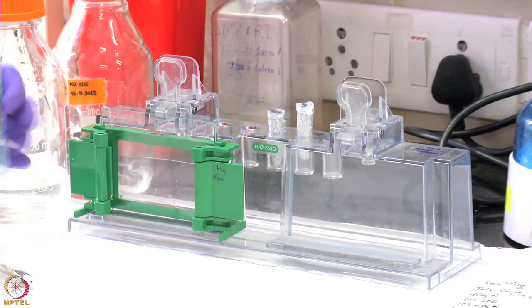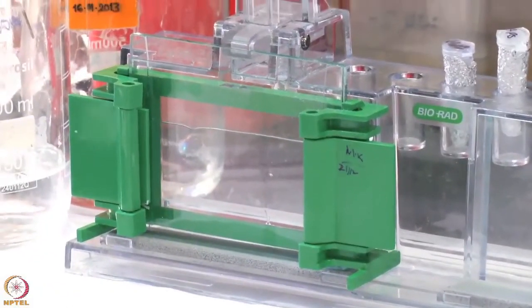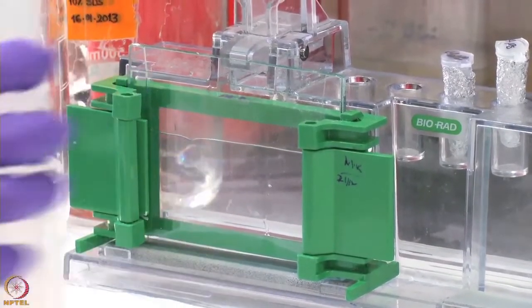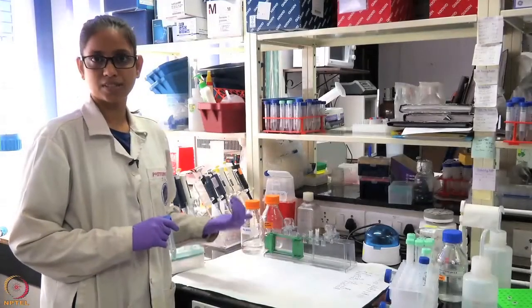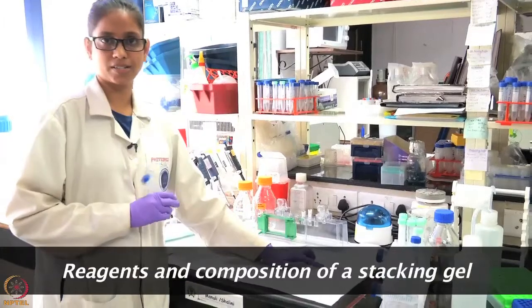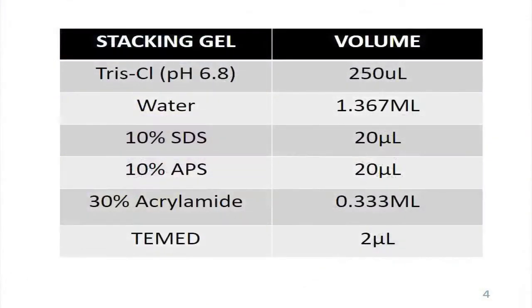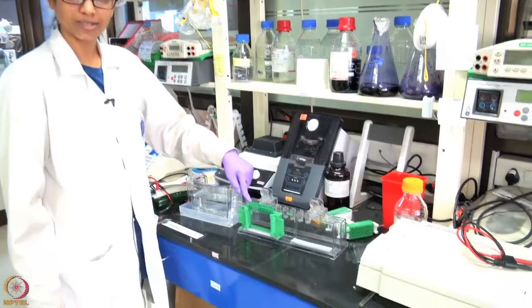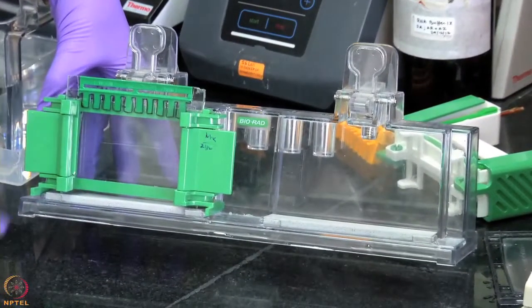Fill the gel up to the indicated level, then add isopropanol to remove any bubbles present up to the green line. While the resolving gel solidifies, start making the stacking gel. The stacking gel composition is the same as the resolving gel except the Tris-HCl solution used is pH 6.8, unlike the resolving gel where it was pH 8.8. Once the gel is cast, the comb is placed. For easier visibility, mark the wells formed by the comb.